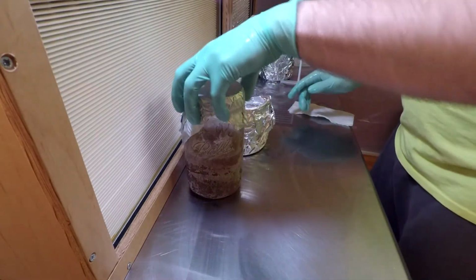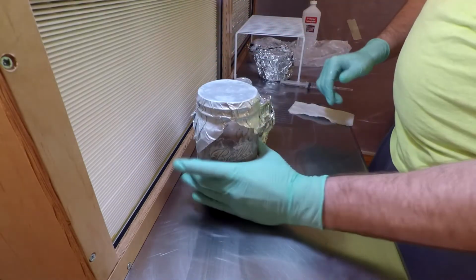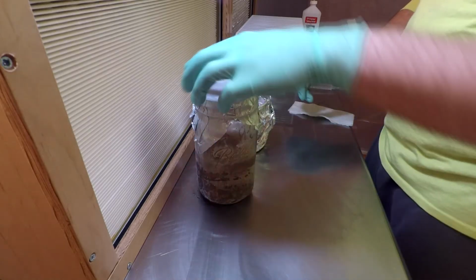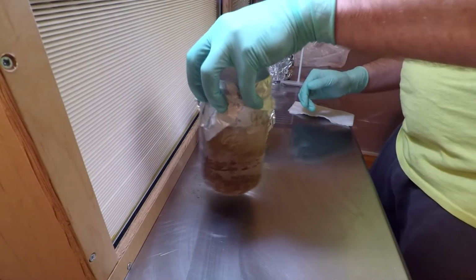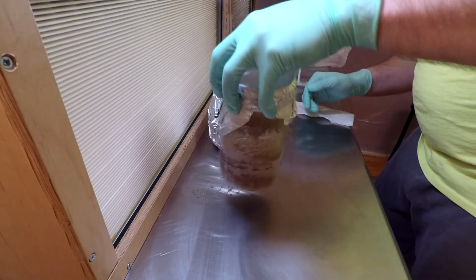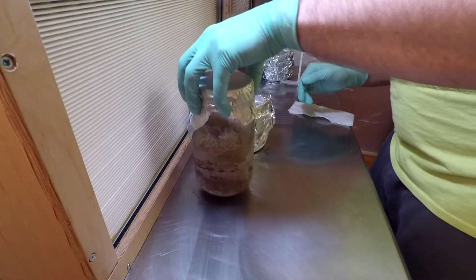So I'm going to go ahead, give this another swirl. I can also feel it too, and it's just warm. And when you swirl it, I can see it kind of hang up on the sides just a tiny, tiny bit. Like it's a little bit of a gel.